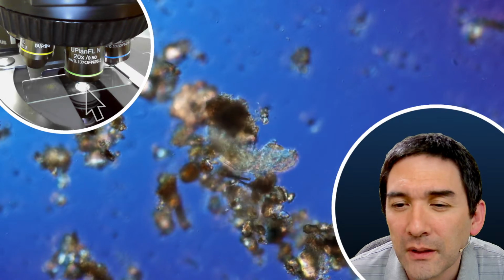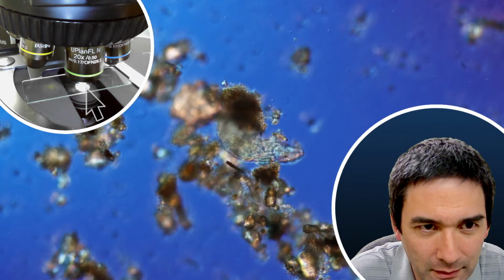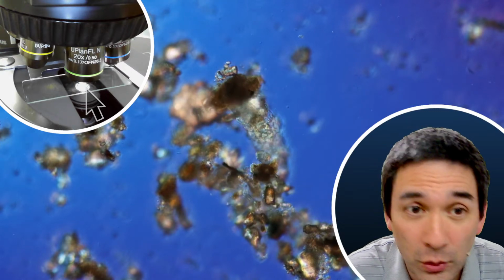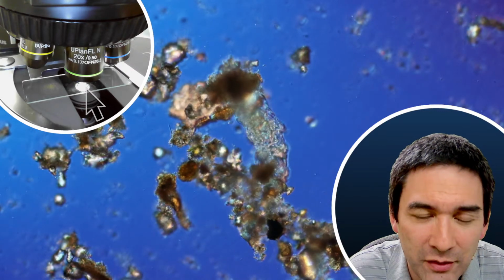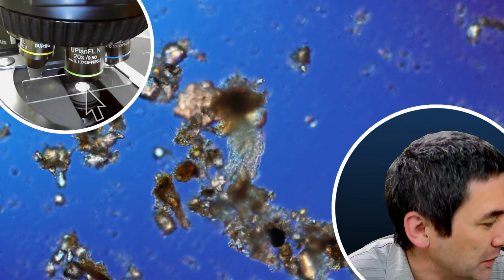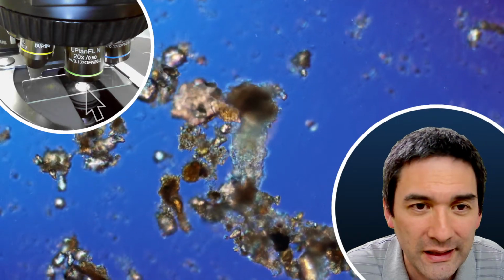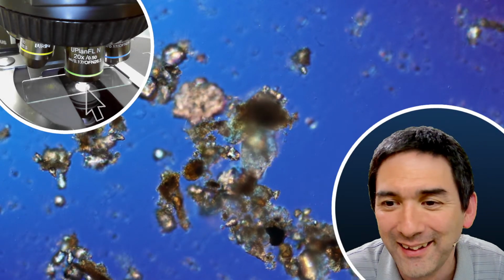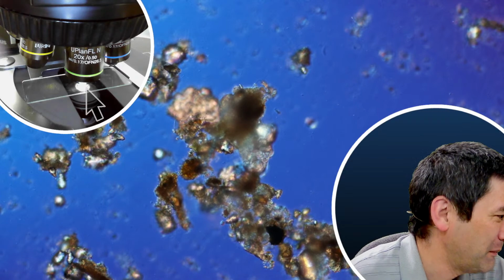Is it better to observe tardigrades without a cover glass? No, and that was my mistake, maybe. It's almost always better to use a cover glass. The reason why I did not use one now is because I wanted to quickly check, and I was a little too lazy, I'll be honest with you, to put a cover glass on it. I simply wanted to check, and then I found this one over here. Now if I put a cover glass on it, I might have problems finding it again. So this is the issue that I'm having right now.